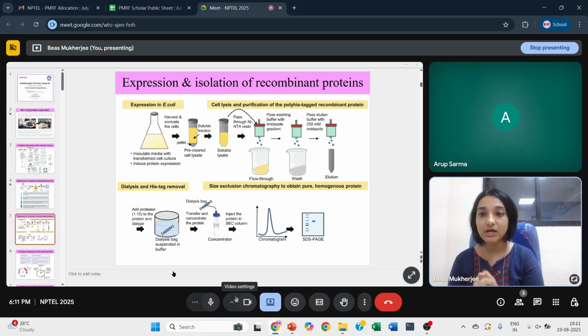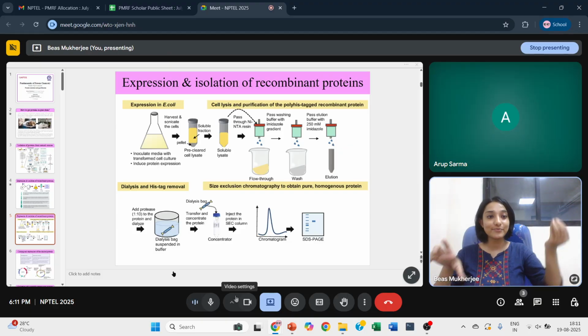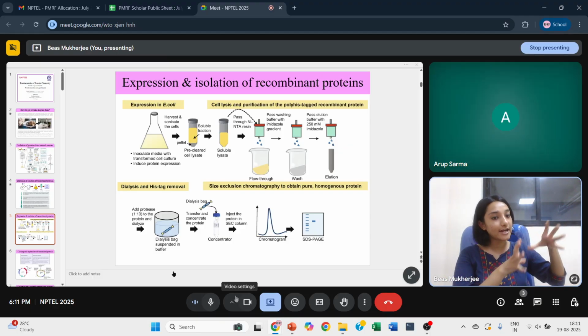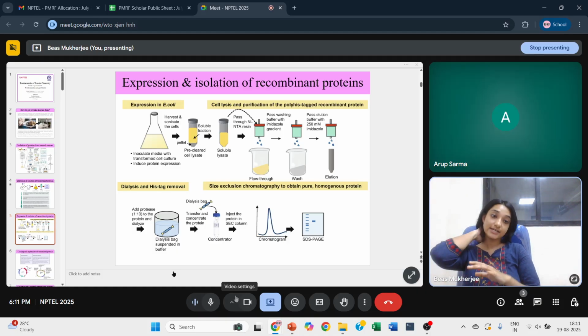Okay, now see, inoculation of the media with the transformed cell culture. Basically there is this Luria Bertani broth, and this is made previously and autoclaved to make it completely sterile. Now this broth is like you just add water and then it is ready. What is it made up of? It is made up of yeast extract, tryptone and everything. All of the ingredients can be separately added to make LB. Otherwise, prepared LB is also purchasable from the market. Okay, now we just add in water, we autoclave it and we keep it, and it is completely sterile.